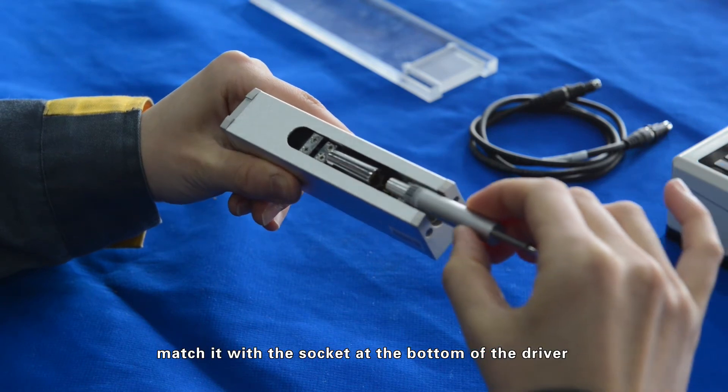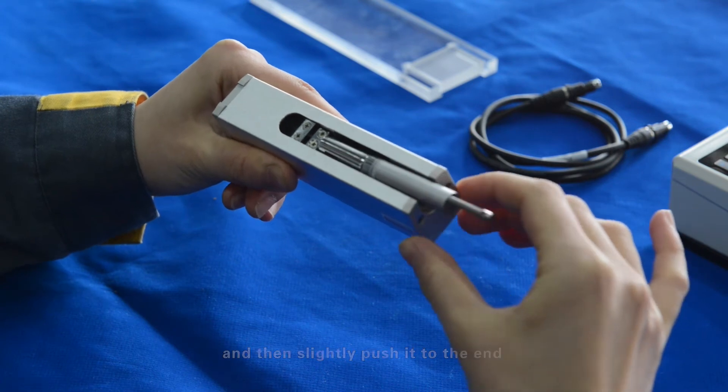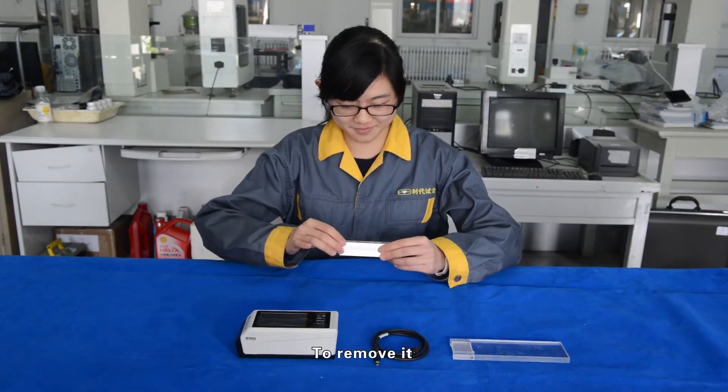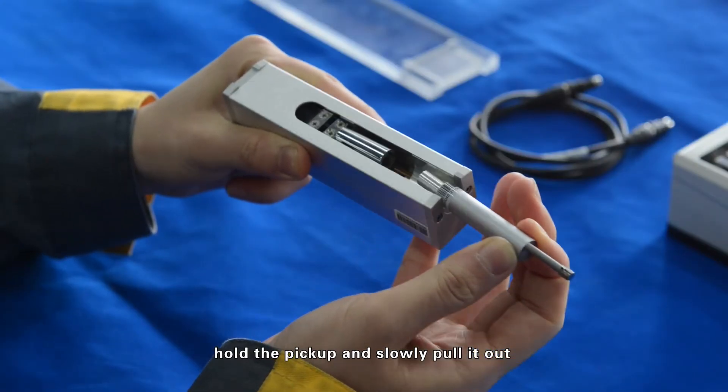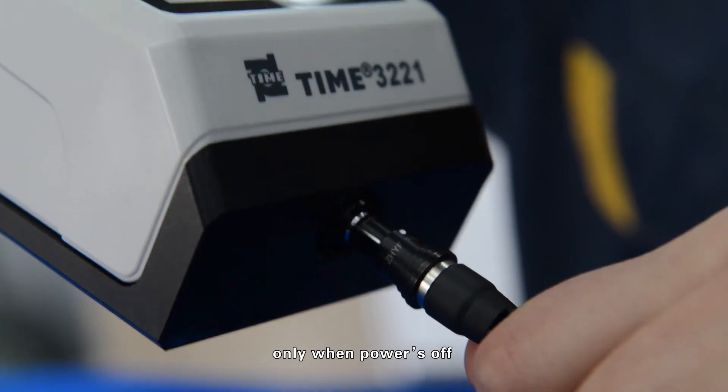To install the pickup, hold it, match it with the socket at the bottom of the driver, and slightly push it to the end. To remove it, hold the pickup and slowly pull it out. Only connect the driver and main unit when the power is off.